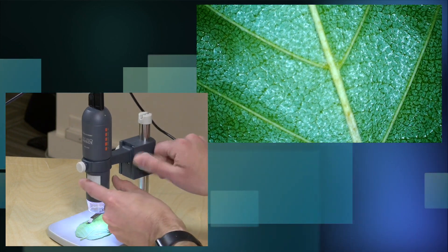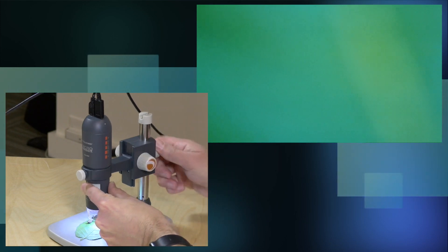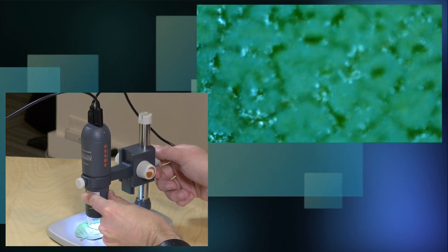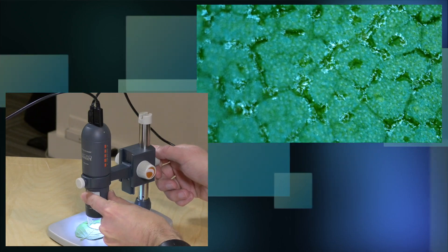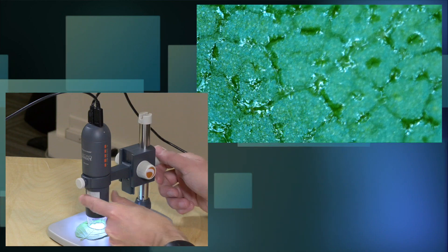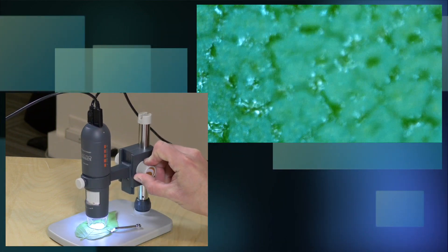It's a shame it doesn't go down beyond 220x, but you can certainly get in pretty close to things that kids see every day that they might want to study in closer detail. This is now at the full magnification and it's really cool just to be able to have some huge image here that you can manipulate in real time and then when you're ready take a picture. Really cool stuff.